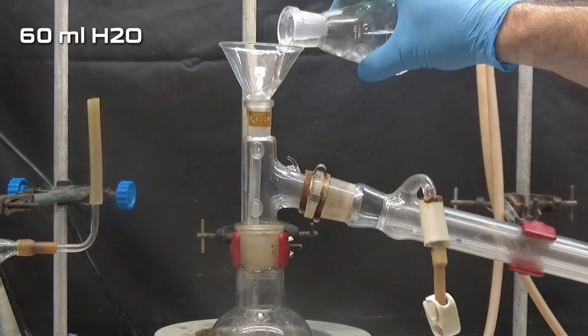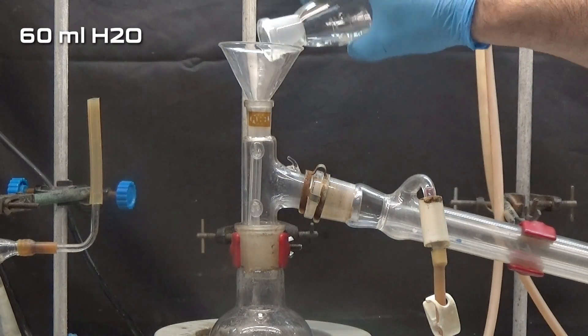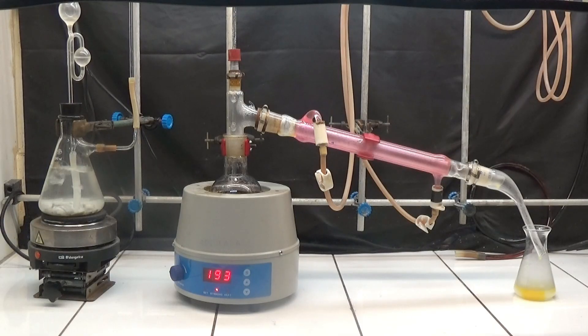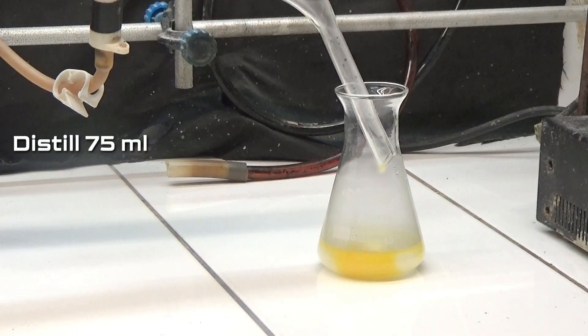We add 60 milliliters of water and set up a steam distillation. Distill 75 milliliters. The distillate contains the unreacted aniline.